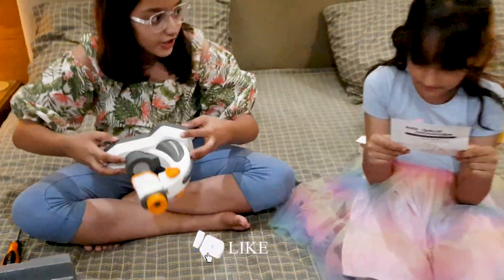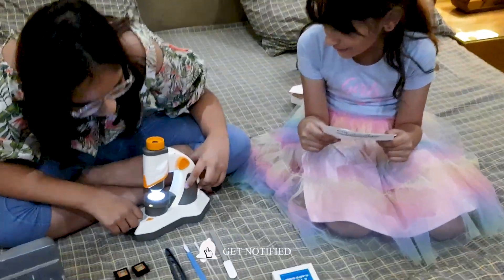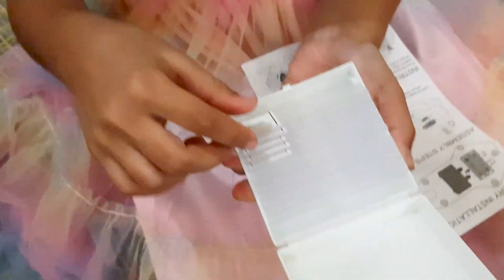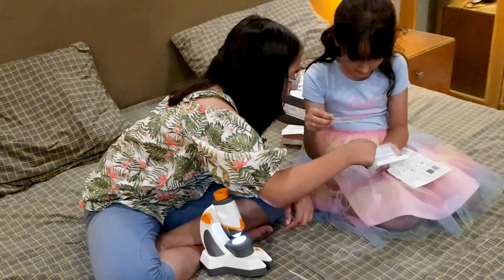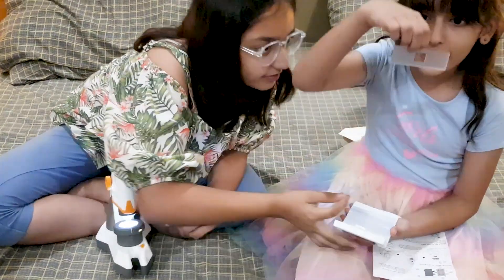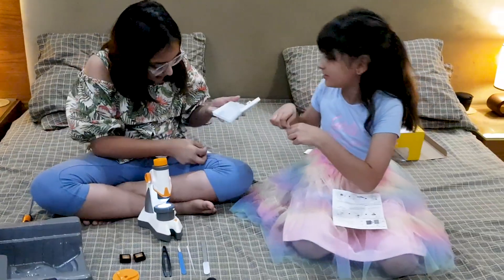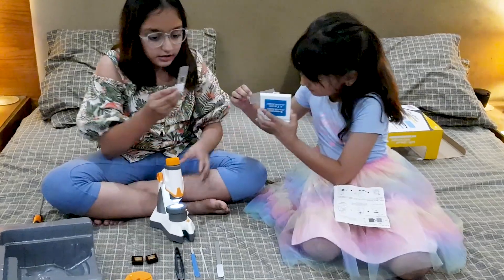Oh look, all done now. I wonder what this button does. Whoa. Hey, what does that do? Open it up. I think this is the stuff that you can see. Whoa, whoa, whoa! What? Chinese rules. Wait a second, let me get the last one. We can even make our own. What? What? I think I'm going to do both.